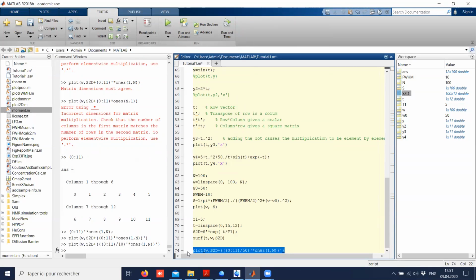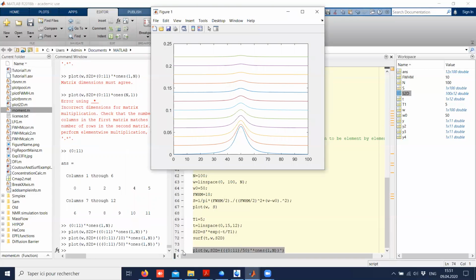Sure. Sorry, I was on mute. Yeah, that looks great. And I guess you can do a very similar thing for the X column, and that would shift them all to the side. And that would create the stack plot. Exactly, yeah. This sort of thing is possible. Yeah, it's very nice, thanks.